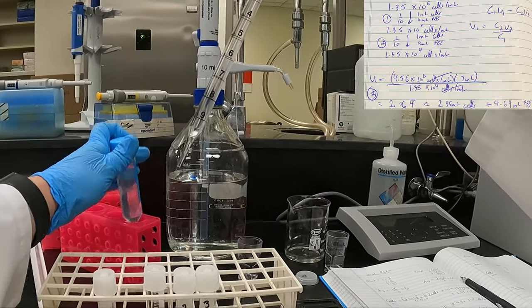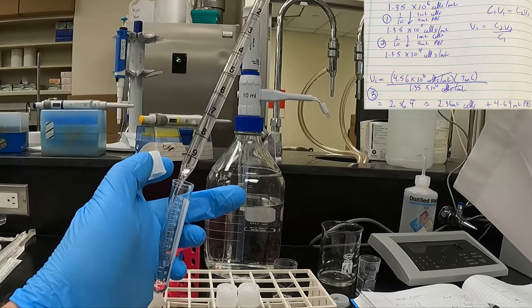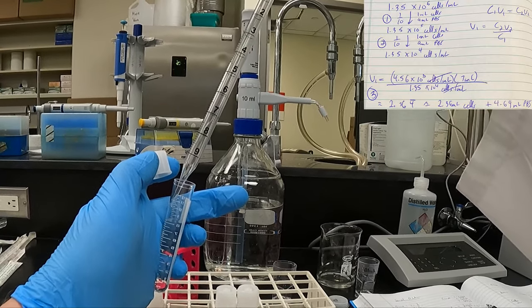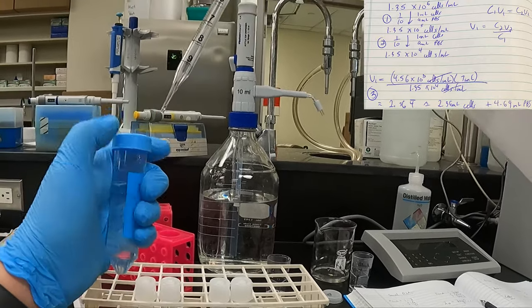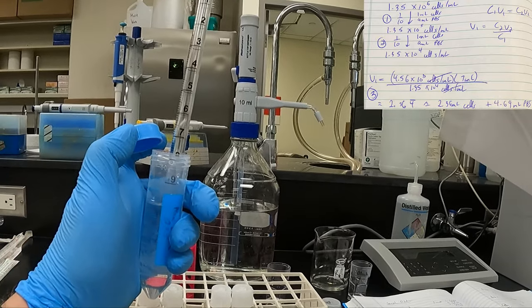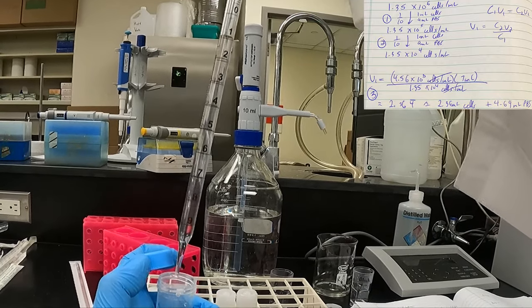9 mils of PBS. Add that into the test tube. Now, because I'm using the solvent here, I will reuse this pipette and add another 9 mils. I will not do this moving forward for the cells. Again, 9 mils of PBS.